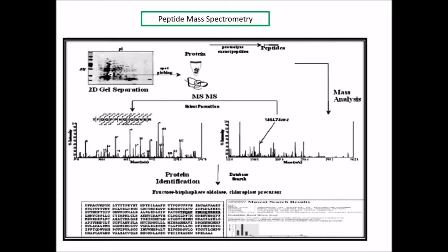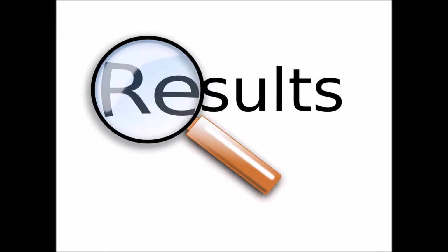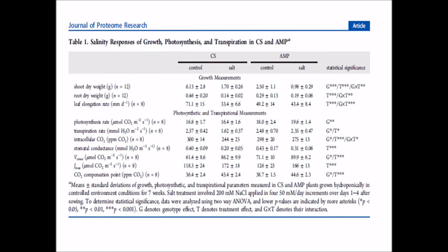And mass spectrometry. The process aims to produce a collection of peptide fragment ions that differ in mass by a single amino acid, allowing one to read the amino acid sequence of the precursor peptide. The number of matched peptides and coverage data are taken from the Mascot search engine. Breakdown products were assigned to spots that are presented at lower molecular weights compared to a reference map of the wheat mitochondrial proteome.